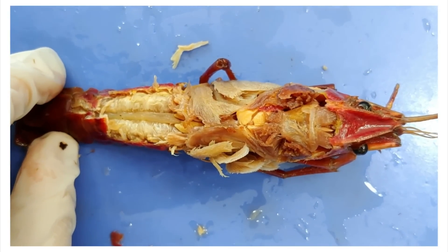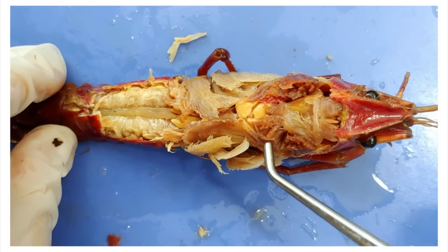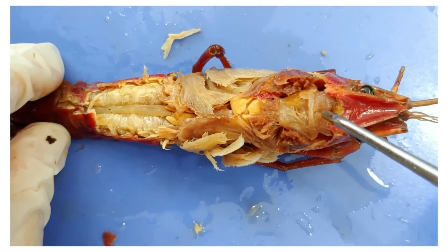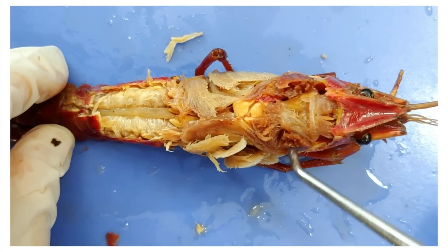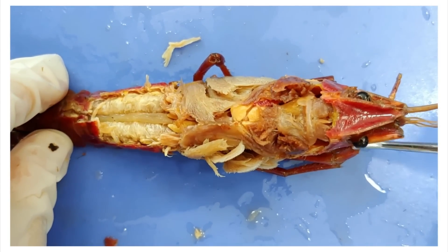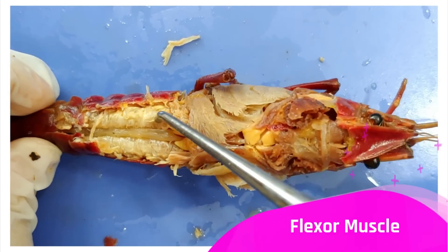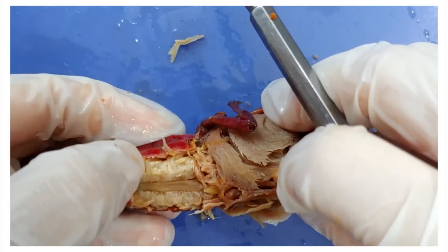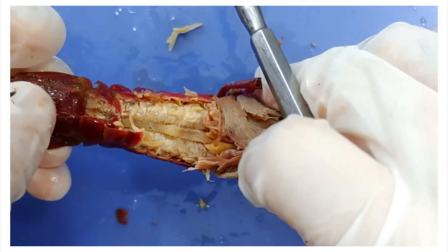I'm going to quickly run through some muscles now. First, they flex the posterior and anterior gastric muscles, which are attached to either end of the stomach and help with digestion. Then there are the mandibular muscles, which move the mandibles on the other side. They also have abdominal muscles: the flexor muscle, which curls the tail, and the smaller extensor muscles on the side, which work to extend the tail.